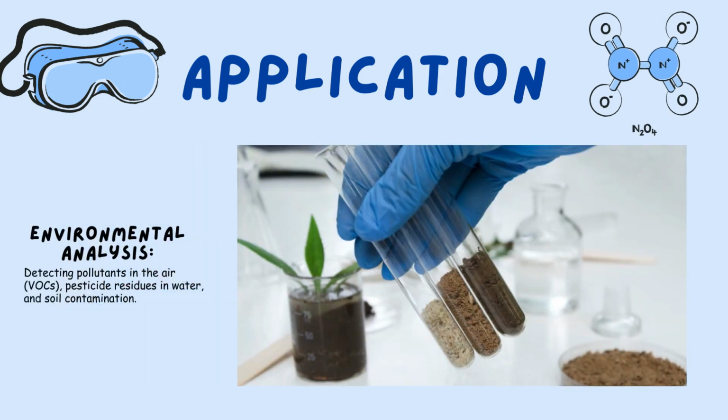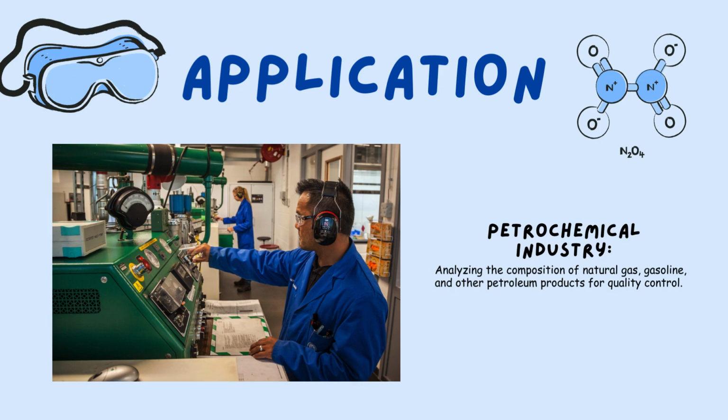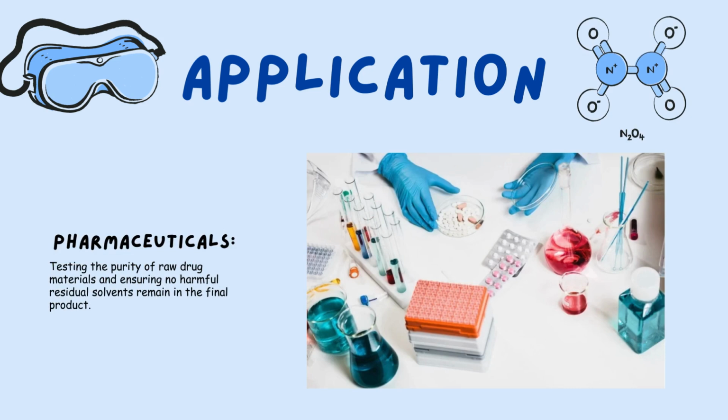Environmental analysis detects pollutants like VOCs in air, water, and contaminated soil samples. The petrochemical industry analyzes gas and gasoline composition for rigorous quality control. Pharmaceuticals utilize GC to test drug purity and identify harmful residual solvents in products.